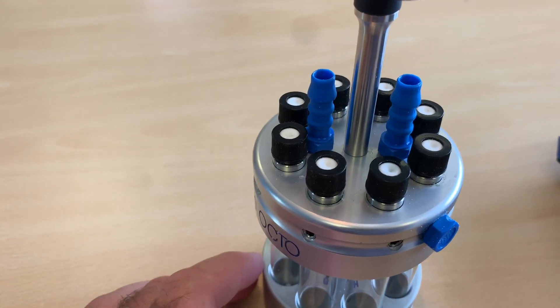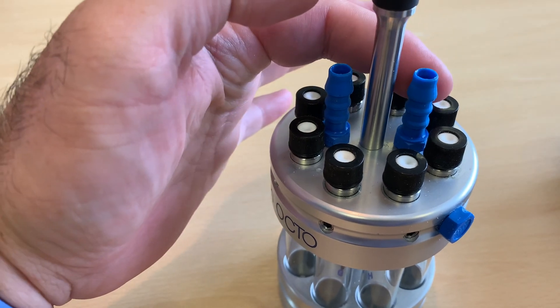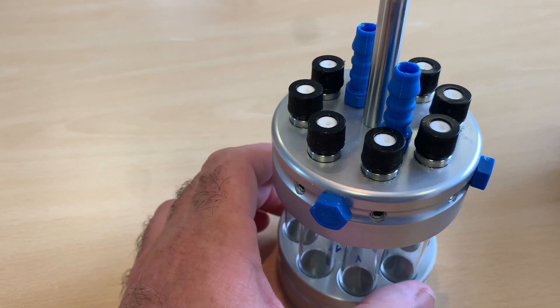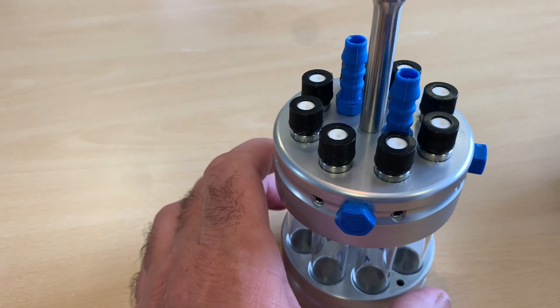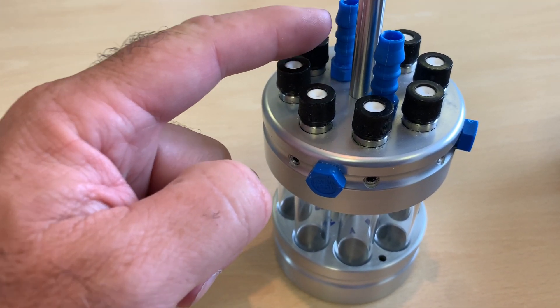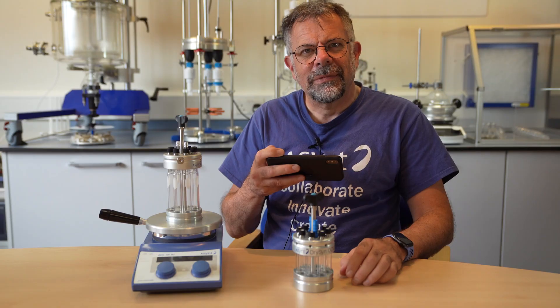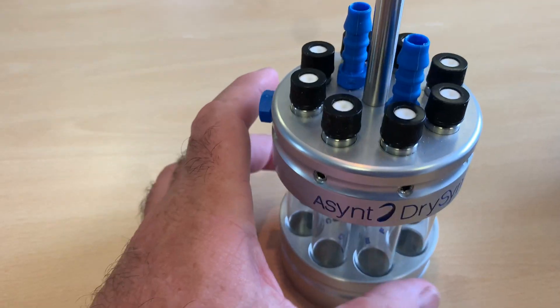And again, perfectly acceptable — we use these very simple, effective plastic input hoses for gas addition, vacuum, whatever, and then plugs on the side, whether you want to have these on the top or at the side. So it wasn't really making me totally happy.